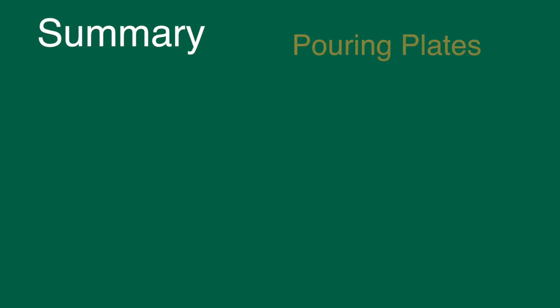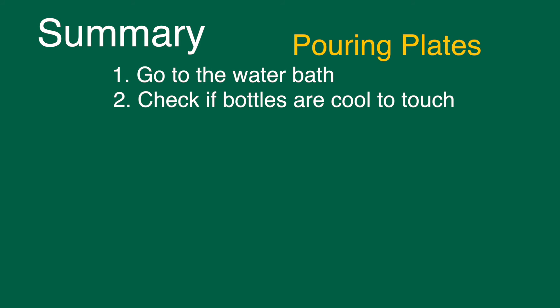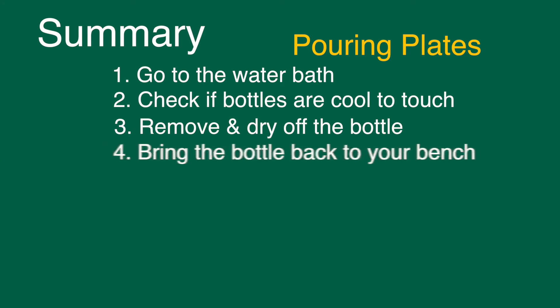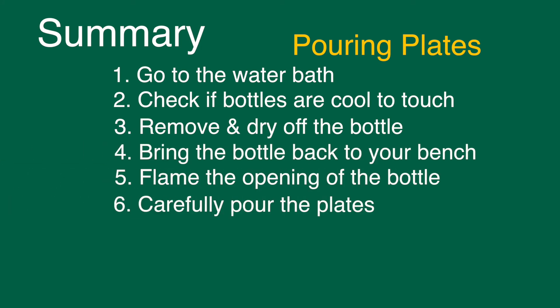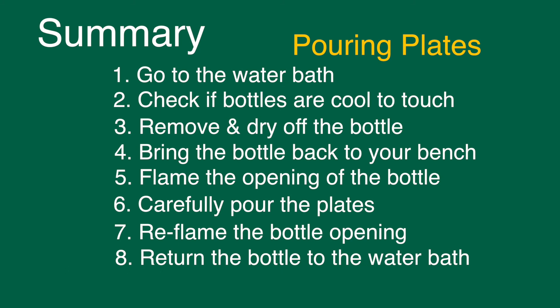In conclusion, when you're pouring plates you have to approach the water bath, make sure the media bottles are okay for you to touch, remove them, and dry them off. Once you've retrieved the bottle, bring it back to your bench, flame the opening, pour your plates as aseptically as possible, reflame the opening of the bottle, recap it, and then return it to the water bath.